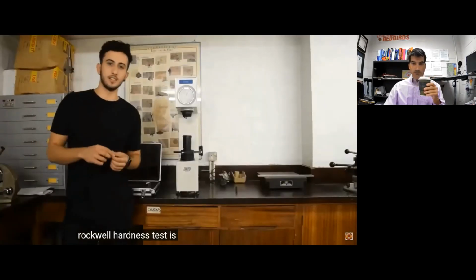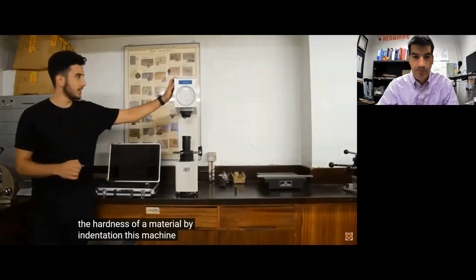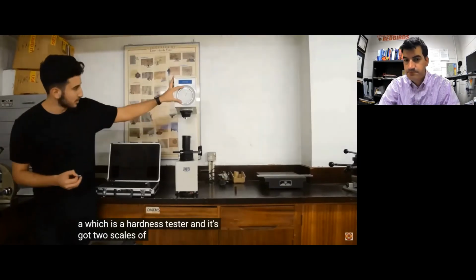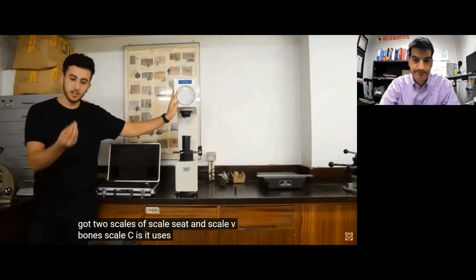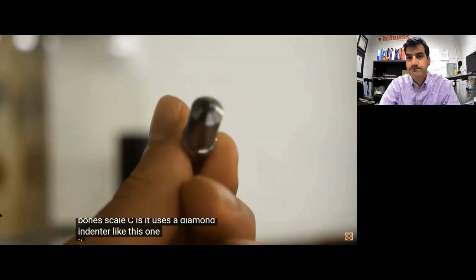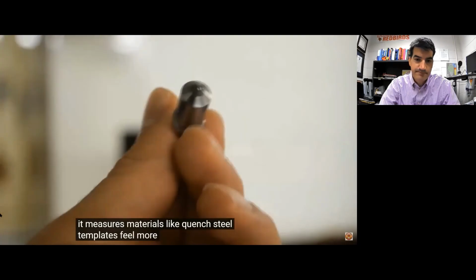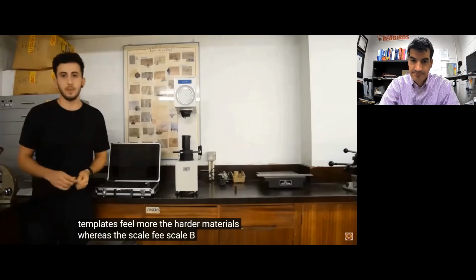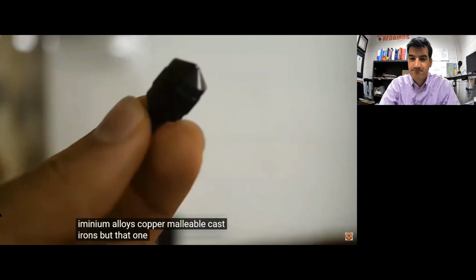The Rockwell hardness test is used to test the hardness of a material by indentation. This machine here is a CV600A, which is a hardness tester, and it's got two scales. It's got the scale C and scale B. That's C and B. Scale C uses a diamond indenter like this one. It measures materials like quenched steel, tempered steel, more of the harder materials. Whereas the scale B measures aluminium, alloys, copper, malleable cast irons, but that one uses a steel ball indenter.